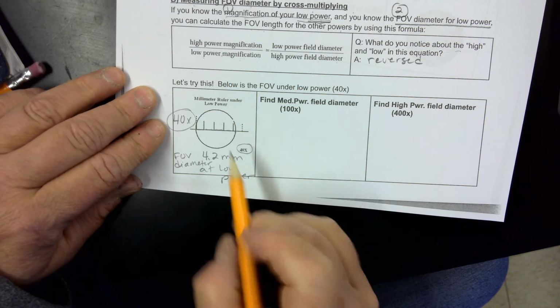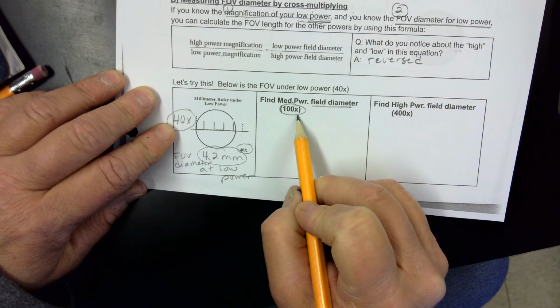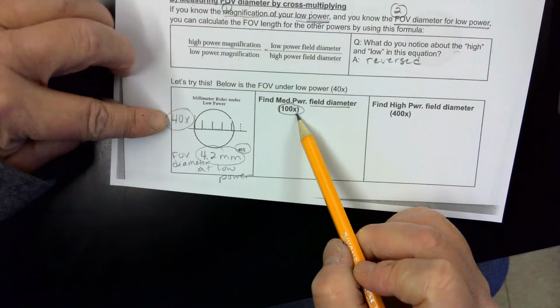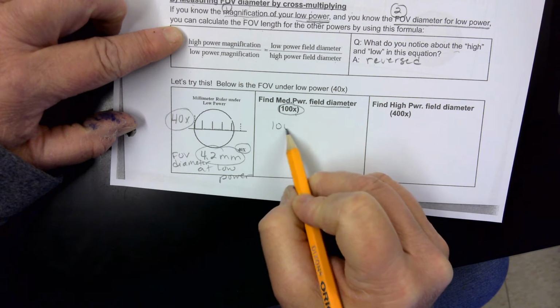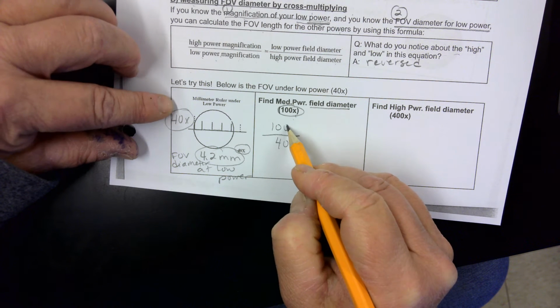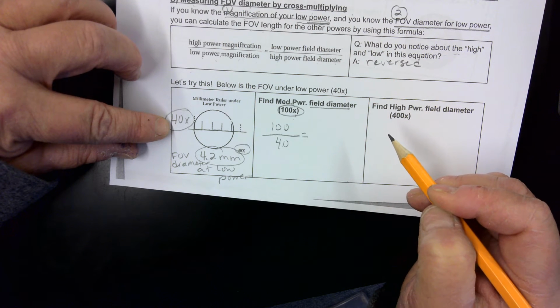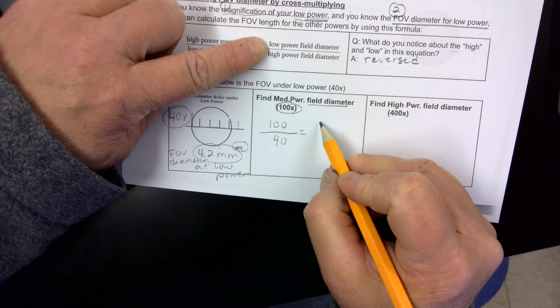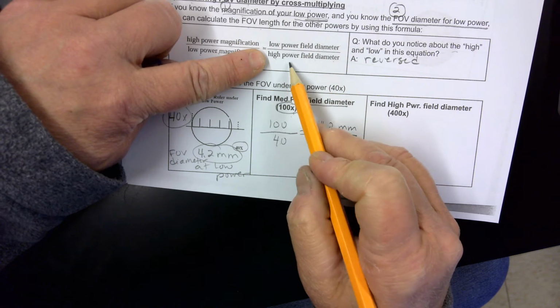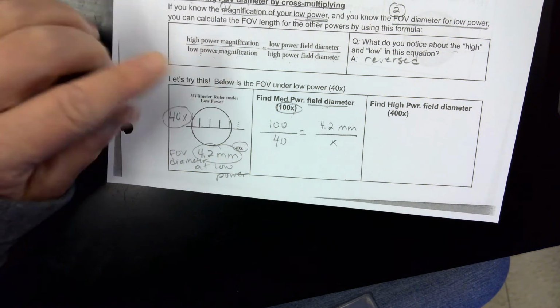Okay, so using those two numbers, we can find the field diameter at medium power, which is 100x. So let's set this up. The higher power magnification in this case is 100, so I'm going to put 100 up top. And the lower of those two magnifications is 40. So the higher magnification of 100 over the lower magnification of 40. We're going to set that equal to the field diameter of the low power, which we measured was 4.2 millimeters. And what we're trying to find is the higher power field diameter. We're trying to find this medium power field diameter. So that's going to be our x.